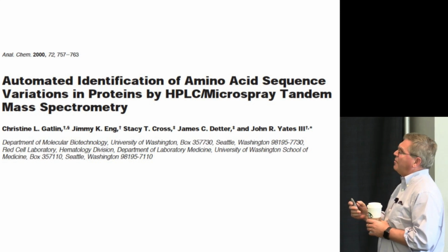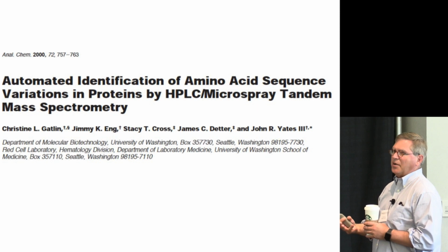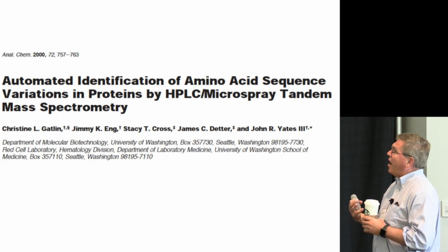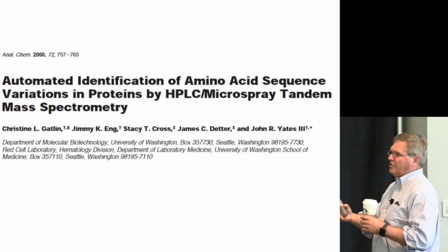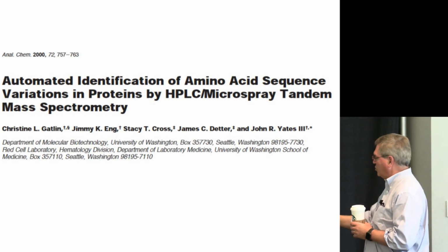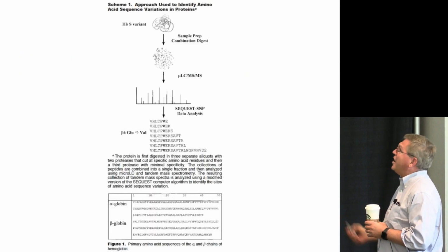And the problem with elastase and subtilisin is that they're non-specific enzymes, and so they create peptides that make people doing database searching nervous, because you have to do a non-preference type of search, which is what we were used to doing, so we weren't the least bit concerned about it. And it worked pretty well.